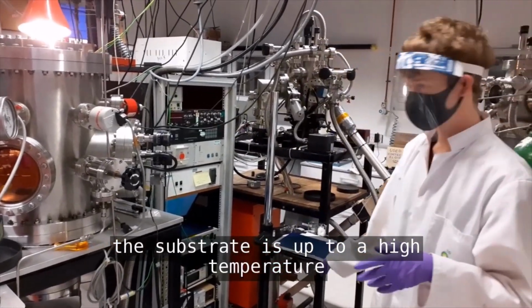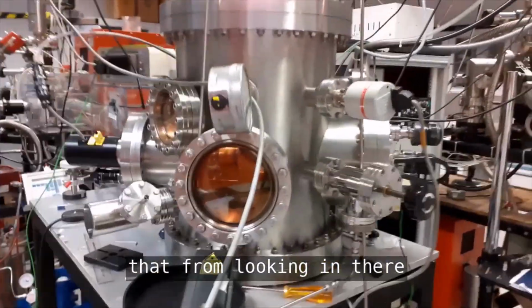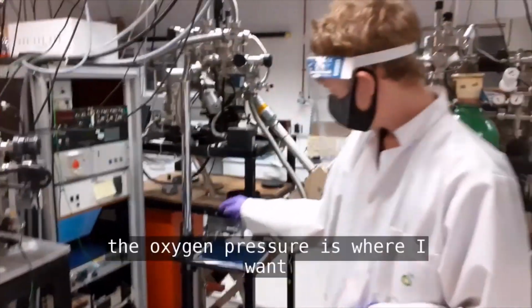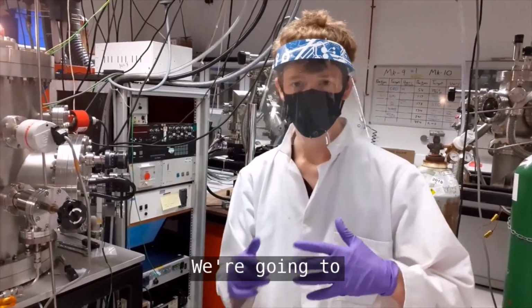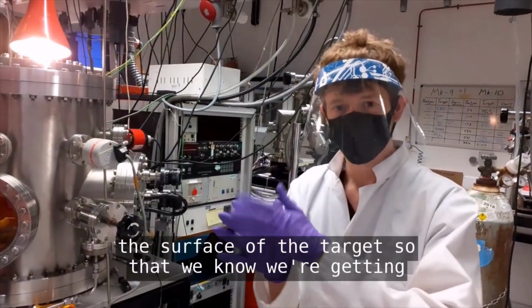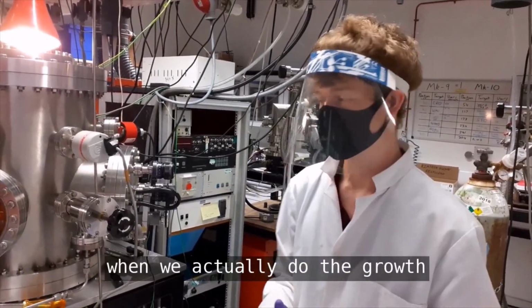The substrate is up to a high temperature. You can actually see that from looking in there, it's glowing red now. You can see from the monitor it's at 750 degrees. I've got the oxygen pressure where I want. So we can start the growth. But before we do that, we're going to pre-ablate the target. This effectively cleans the surface of the target so that we know we're getting a very pure material when we actually do the growth.